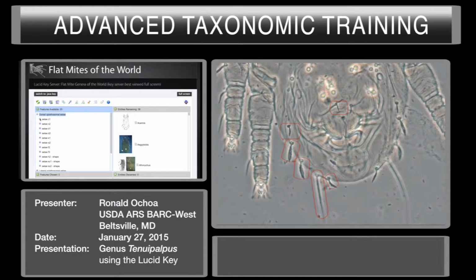How do we know that this is F2? Because it's one extra seta in the count. The base number in the lateral border of the mite usually is 6 setae. When it has 7 setae, it means that you have the presence of the F2 seta. And that is a clue to help you.